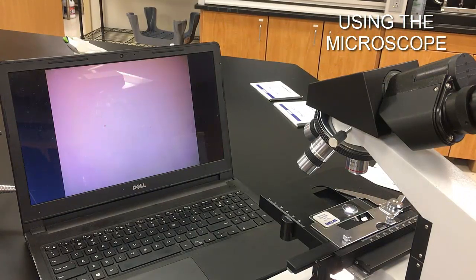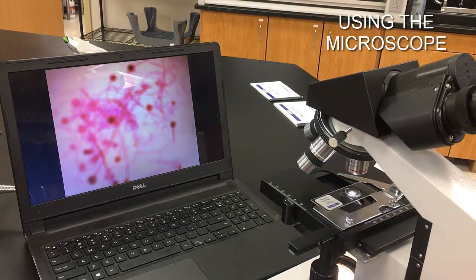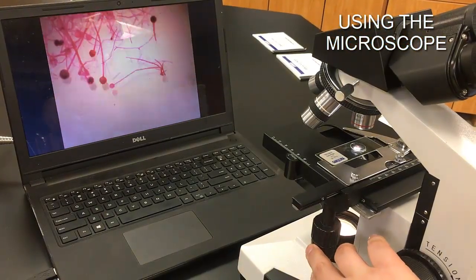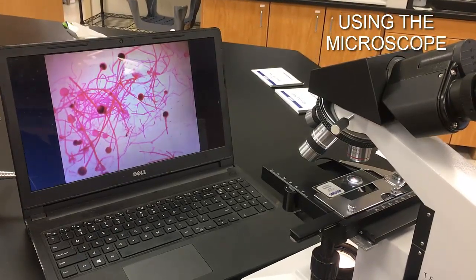Using technology, we can run the microscope through a computer to see what's under it on screen. I've got the image centered and the stage all the way down — as I bring it up, you'll see the image come into focus. I'm using the coarse focus knob to find that focal point. Once I have an image, I can use the mechanical stage knobs to move it from side to side or front to back to scan around and find different things within the field of view.